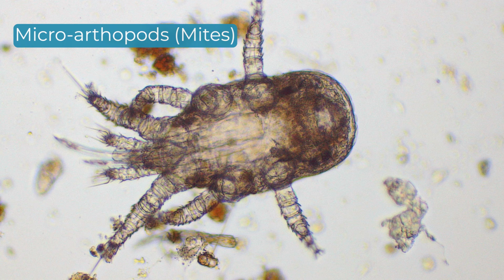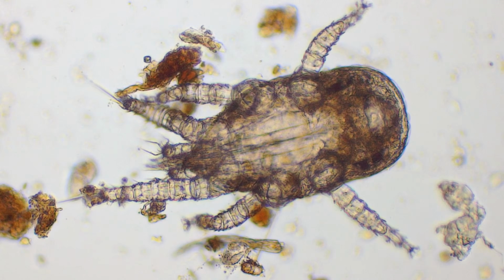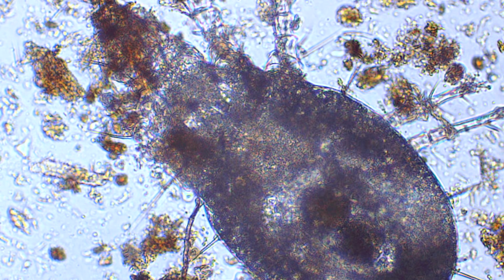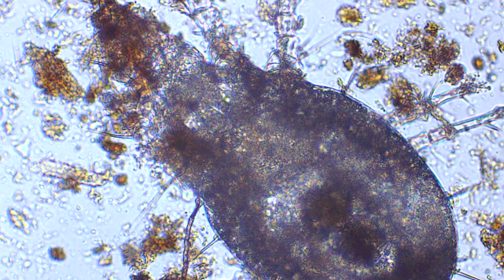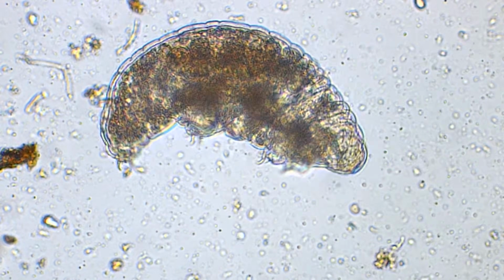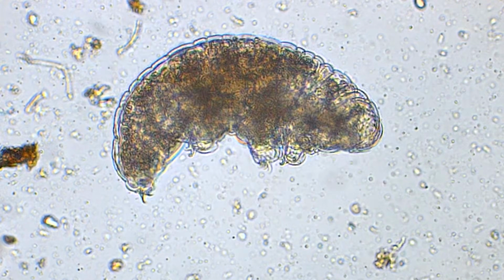Microarthropods and mites. You may also see some invertebrates such as mites under the microscope. They feed on smaller microbes like fungi and nematodes. Their movement within the soil can create more airflow and can redistribute organic matter, while their excrement provides additional nitrogen and nutrients.